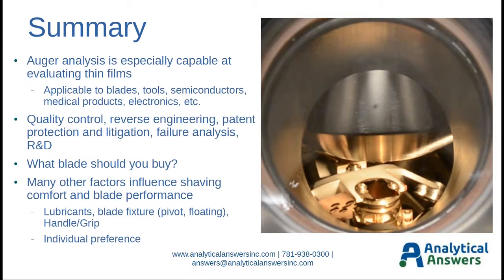All right, so I'd like to summarize now, and I would like to say that clearly Auger analysis is especially capable at evaluating thin films. It is applicable to blades, obviously, but it is applicable to tools and cutting tools that have hard coatings on them, semiconductors, medical products, electronics and electronics packaging. Anytime you're looking for thin layers, whether it be contamination layers or deposited layers, Auger and Auger depth profiling is very capable. You can use it for quality control and reverse engineering of your competitors.